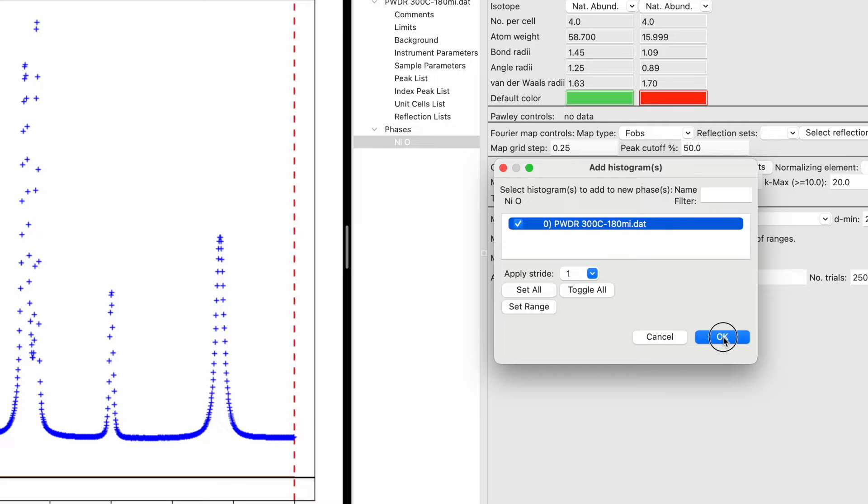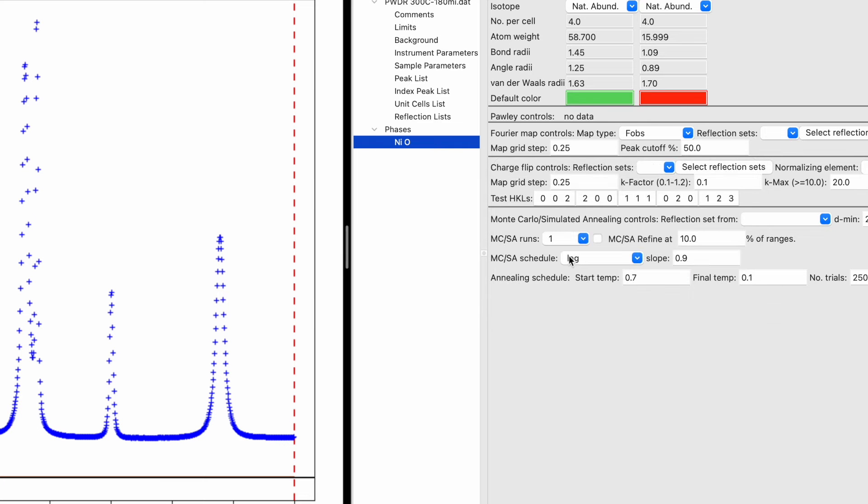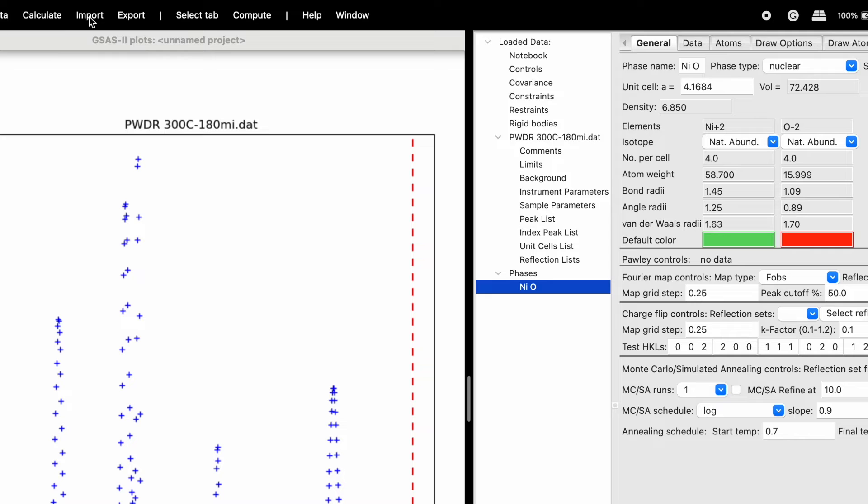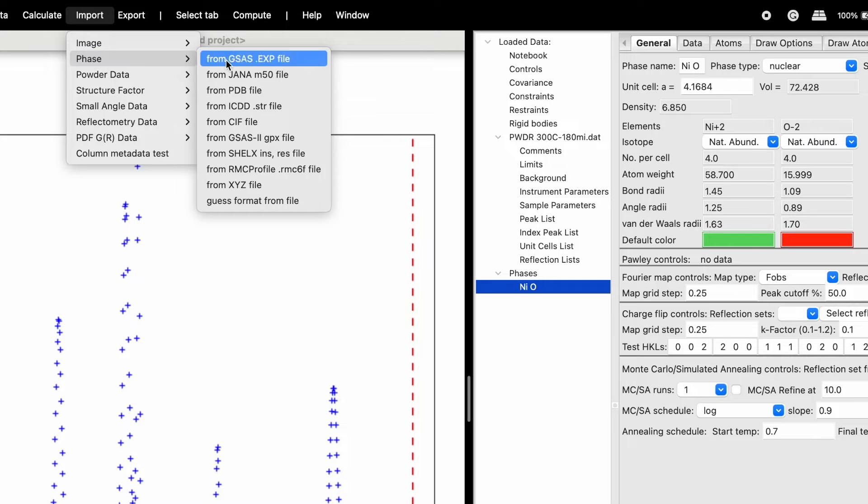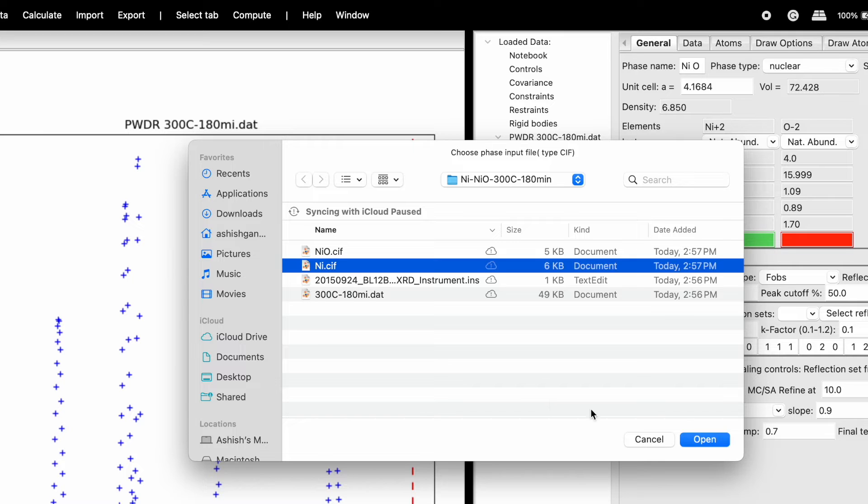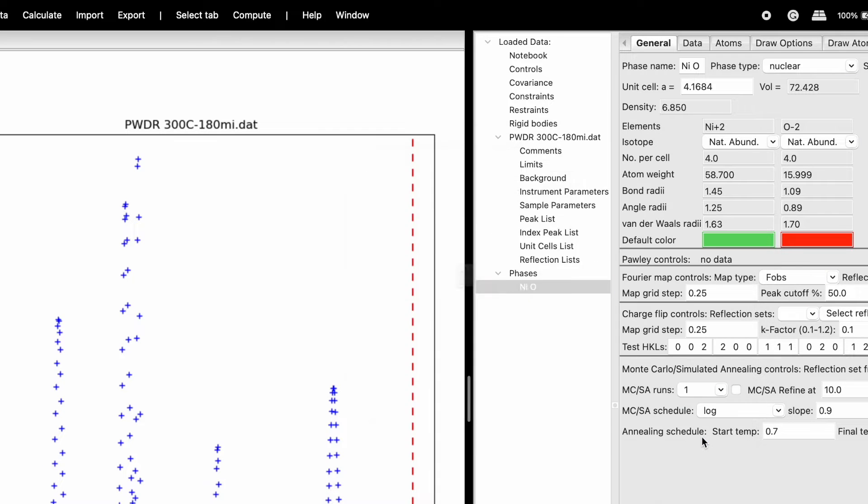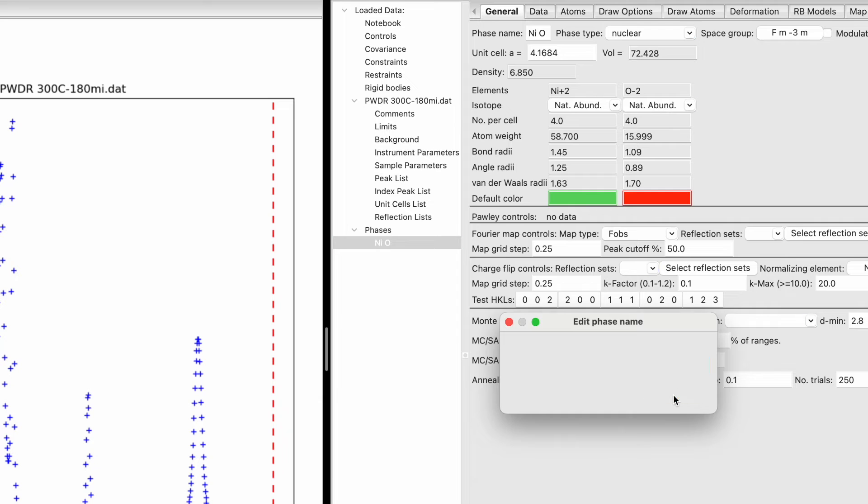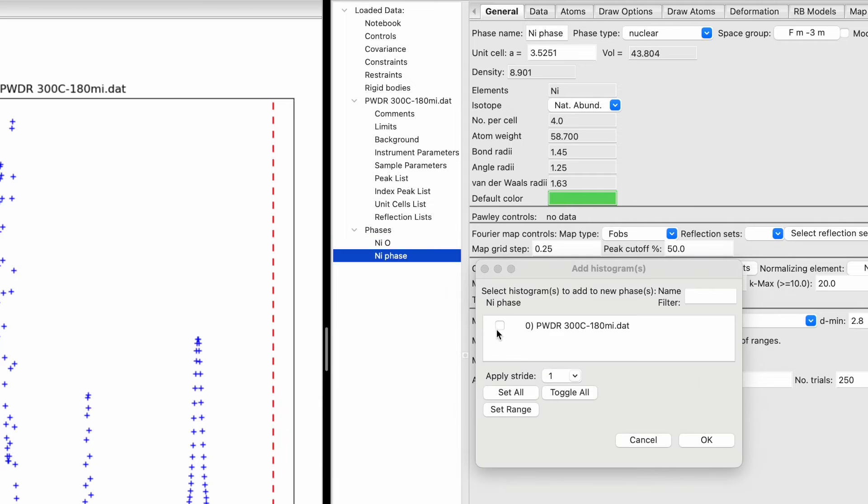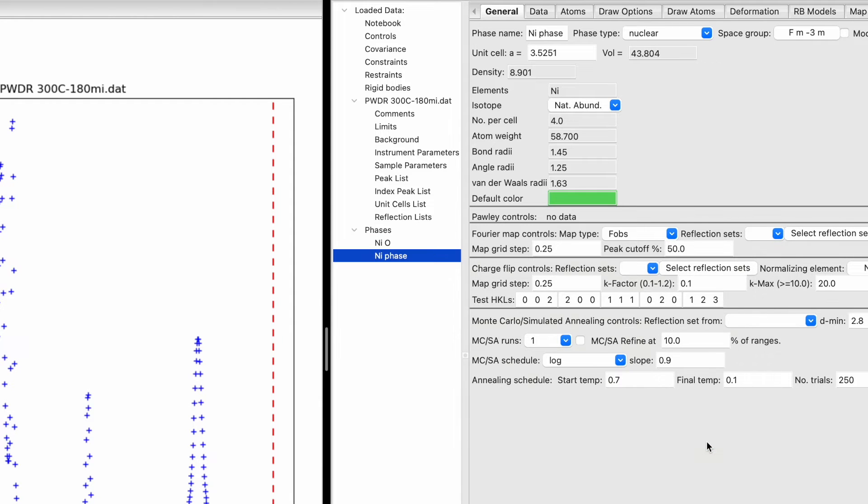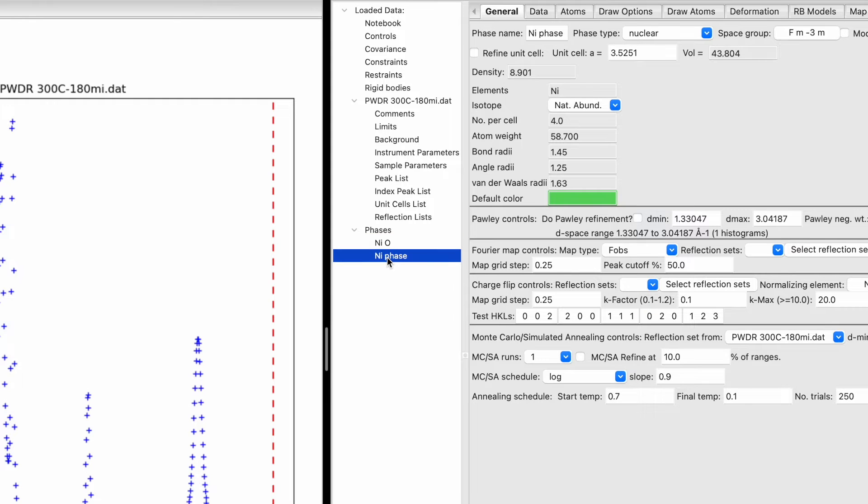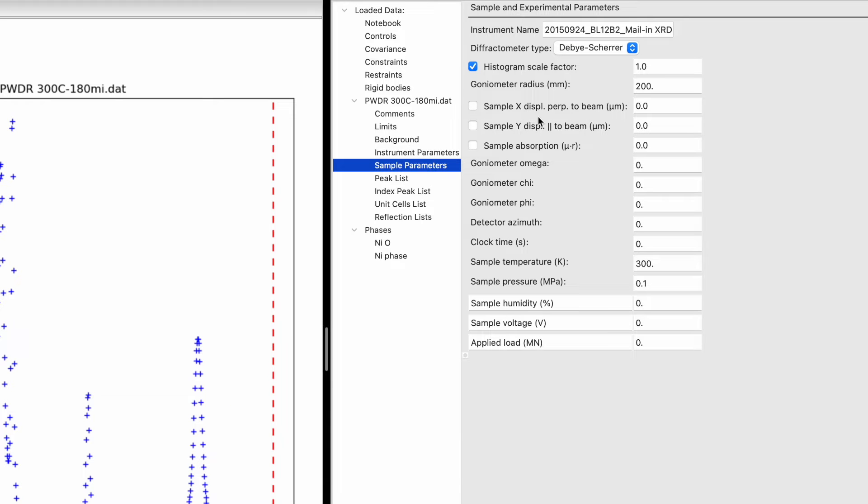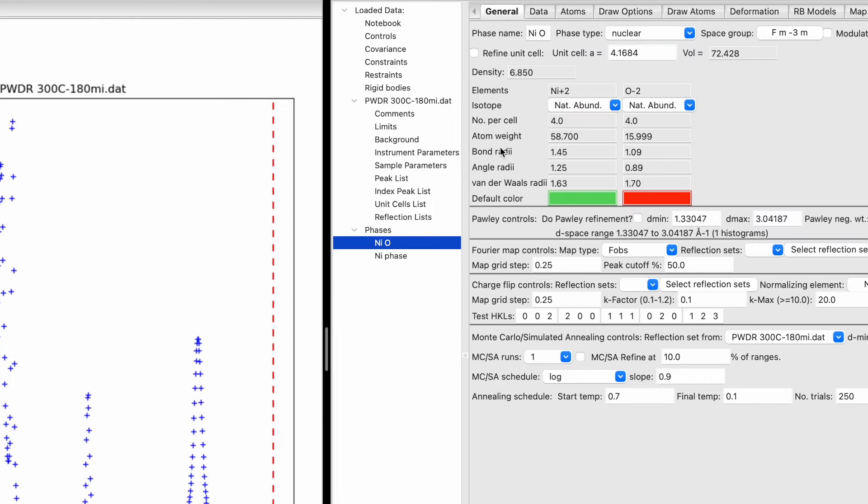Import the second phase CIF file for nickel and check the box. Now we have both nickel oxide and nickel phases. In Instrument Parameters, the wavelength is displayed. In Sample Parameters, uncheck the histogram scale factor and fix it to one.